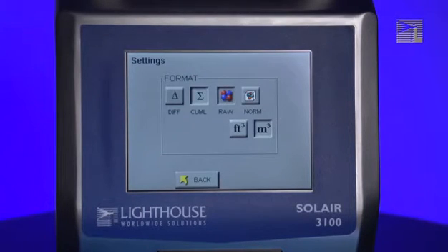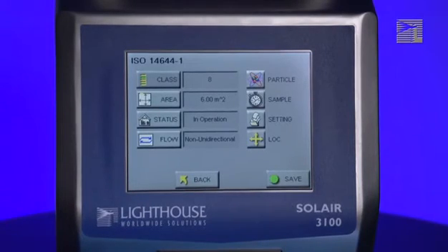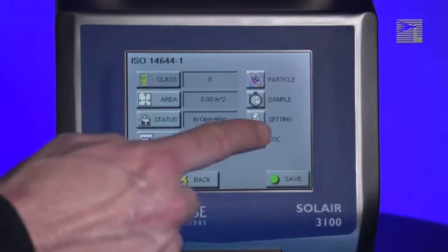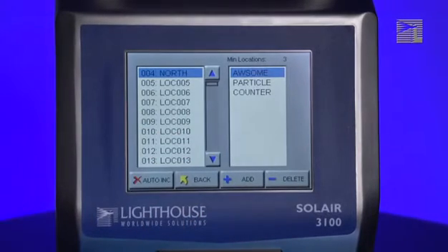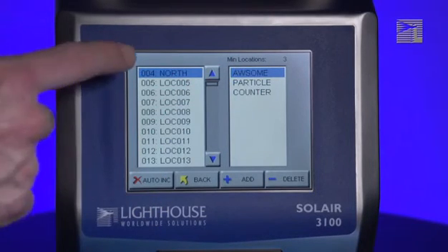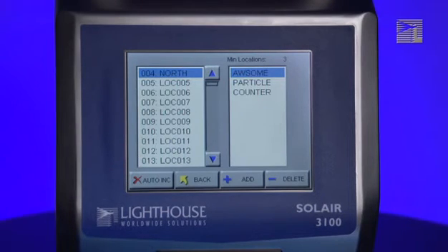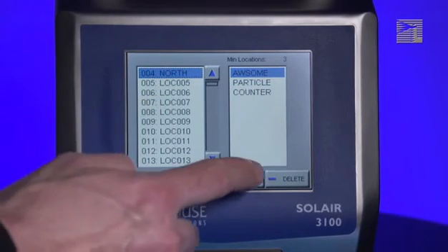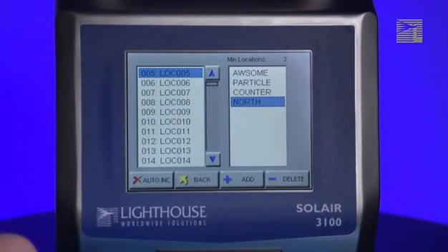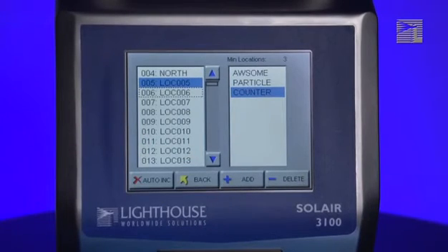When you have finished selecting the settings, press the Back button. In all but the smallest rooms, most cleanroom standards require that samples be taken at multiple locations within the room. To select which sample locations to use for the report, press the Locations button. Two lists are displayed: the locations shown in the list on the right will be used in the report; all other locations shown in the list on the left will not. To include a new location, select the desired location in the left list and press the Add button. To remove a location, select it in the right list and press the Delete button. When you have finished, press the Back button.